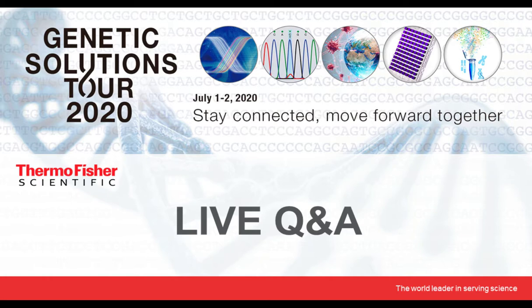And I think we went through a couple of different ways. It really depends upon your sample and the kind of targets that are stably expressed. So if there is a target that is stably expressed, then it can be used as a normalizing agent. Otherwise, as we went through in the presentation, spike-in controls are a good choice, or using global mean normalization. So those are the three options available, and the kind of samples and the presence of different targets which are normally expressed in the samples will decide which methodology to choose.